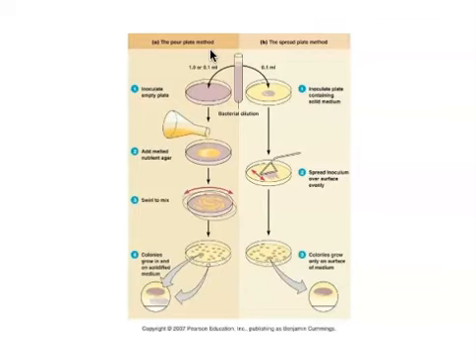Those organisms are better grown on what's called a pour plate, P-O-U-R, instead of a spread plate. Let's take a look at the difference between the two. To make a spread plate, we simply take a sterile agar dish, we place a small volume of our culture or sample in the middle of the plate, and then we spread that material around using a hockey stick.